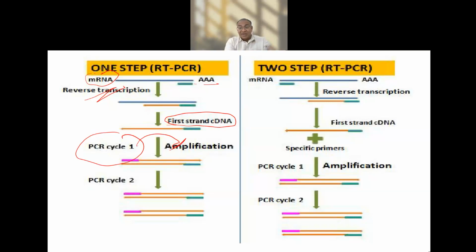I'm synthesizing a DNA. Once I have the formation of this DNA, I then have the same PCR cycle, number 2. You're getting the point here? I don't have a DNA molecule. I have a single fragment of mRNA, messenger RNA. You know the messenger RNA, we also have transfer RNA and ribosomal RNA in molecular biology. So this one molecule of mRNA which I got will allow me to synthesize the DNA of that particular antigen or organism.